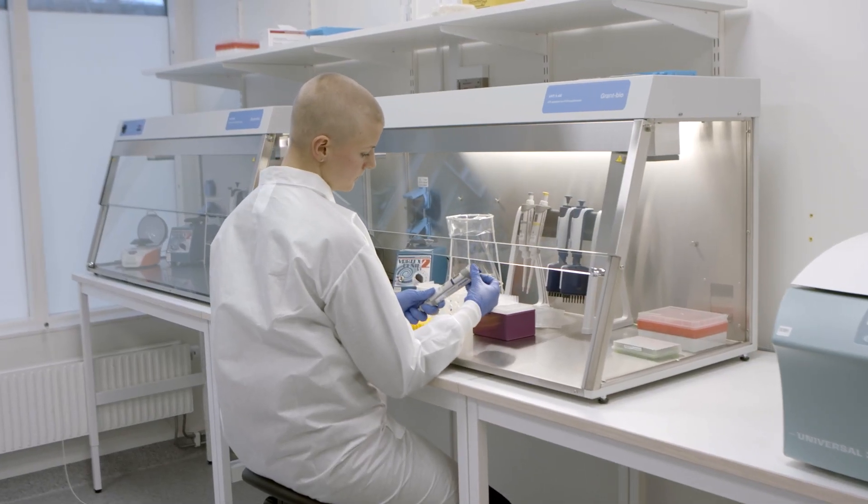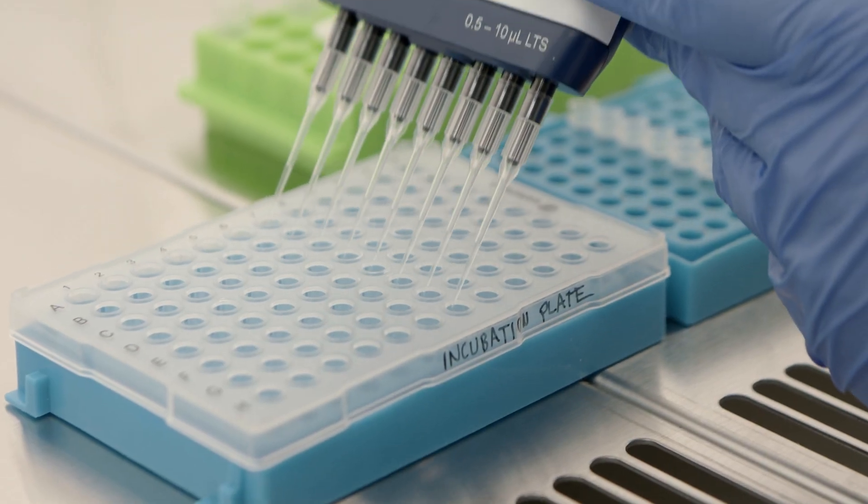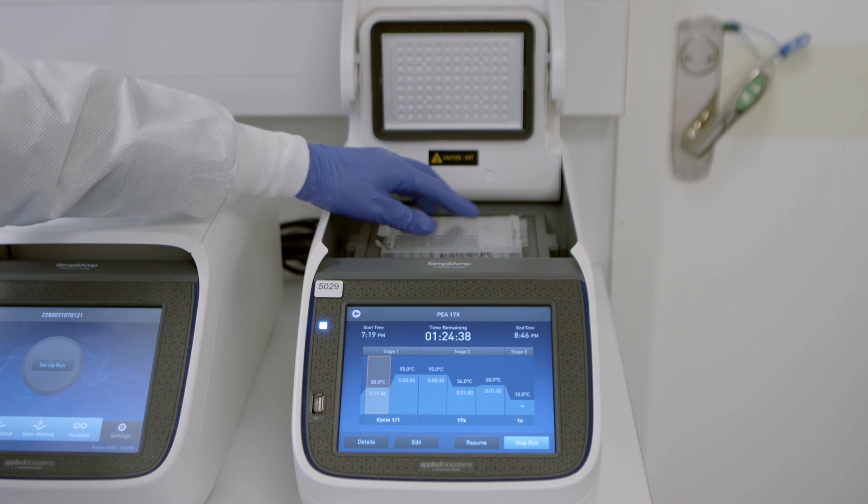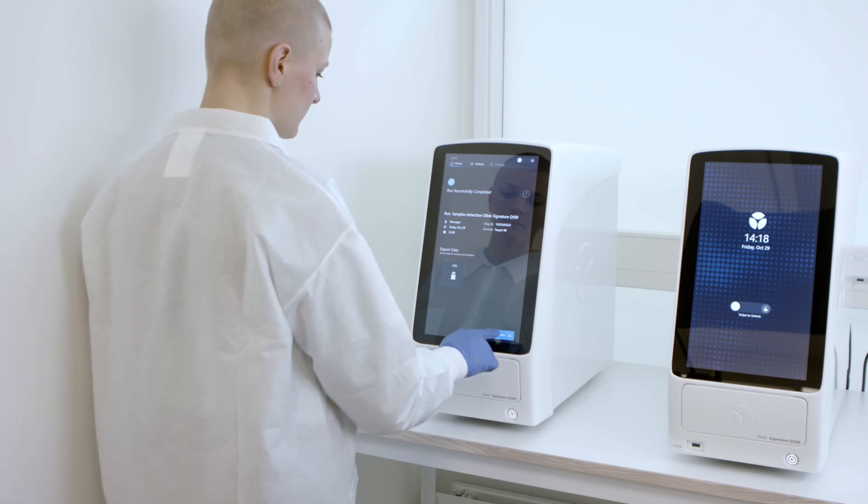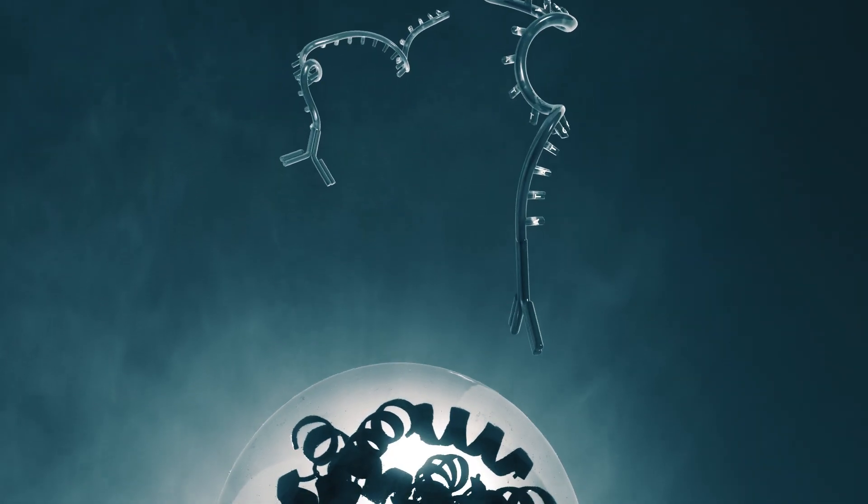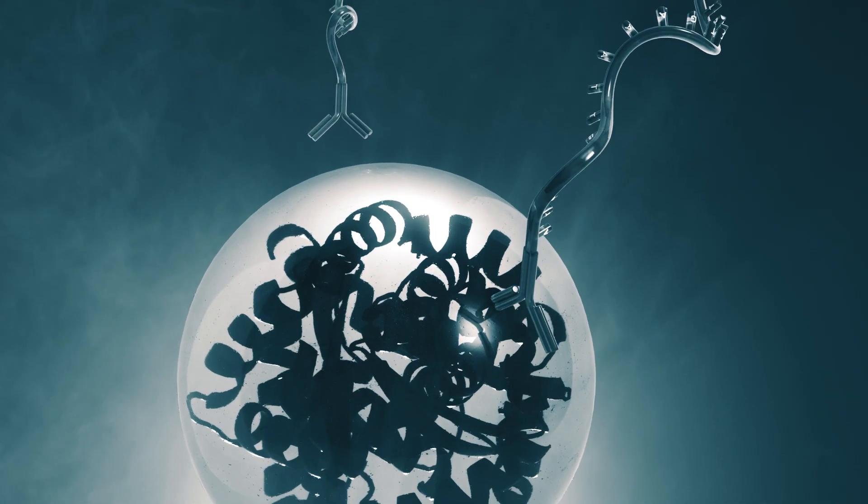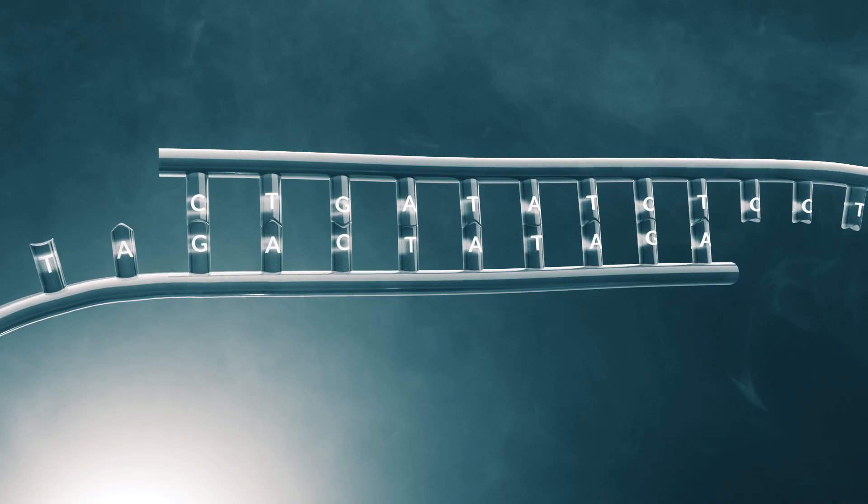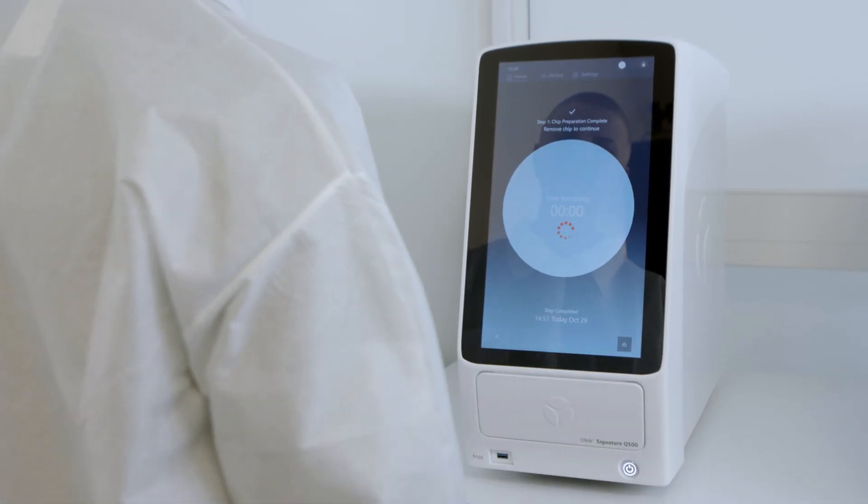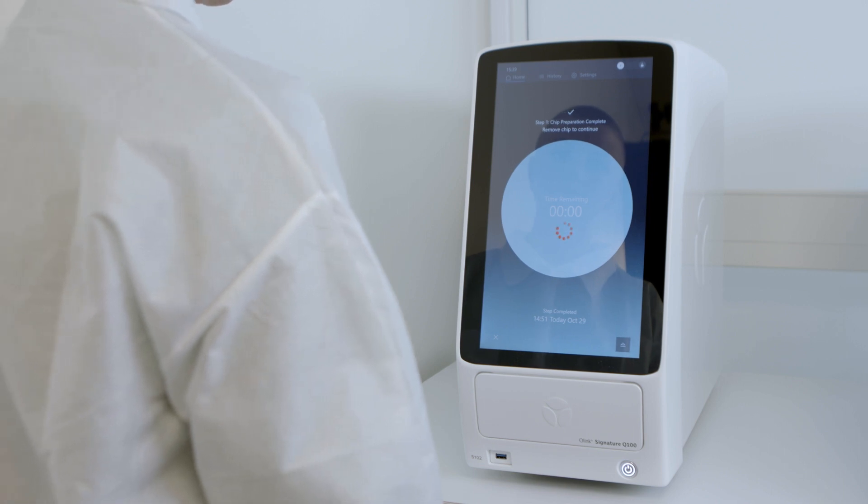The O-Link target protocol consists of three core steps: the incubation step, the extension and amplification step, and the detection step. The target workflow takes place over two days, where on day one, samples undergo an immunoreaction. And on day two, samples are prepared for amplification and detection using qPCR.